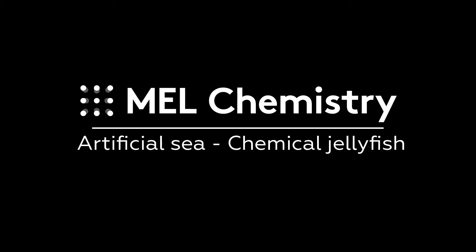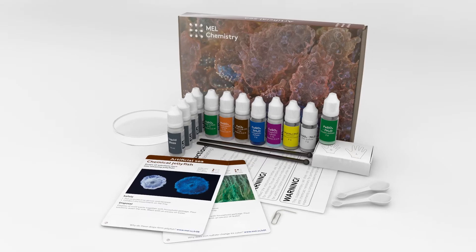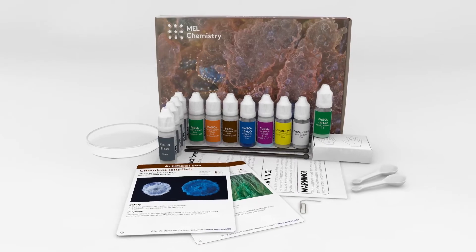Welcome to the wonderful world of chemistry. Today, with the help of the Artificial Sea Set by Mel Chemistry, we will make chemical jellyfish.